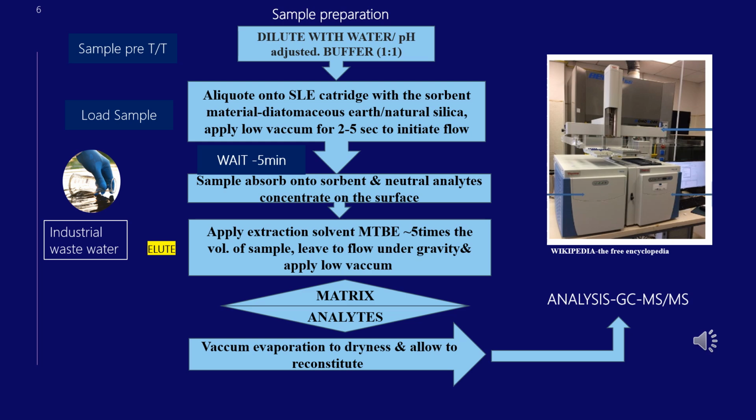These eluted analytes are vacuum evaporated and reconstituted with suitable solvents. These can be analyzed by GCMSMS, that is gas chromatography and tandem mass spectroscopy.